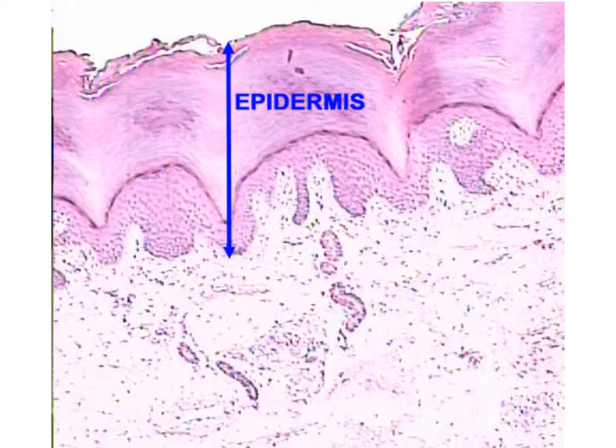On this cross-section slide of the integumentary system, looking at the skin, we can see the epidermis, and then we can see the dermis. We may also see the different layers of the epidermis and the different layers of the dermis. Now the sublayers of the epidermis are called strata, and when one is identifying the various strata, we want to use this very similar to a map.